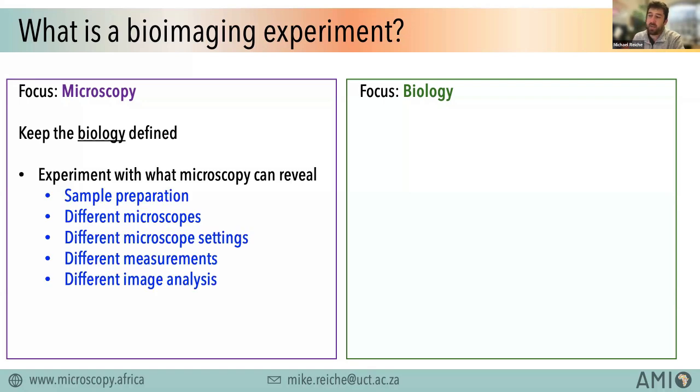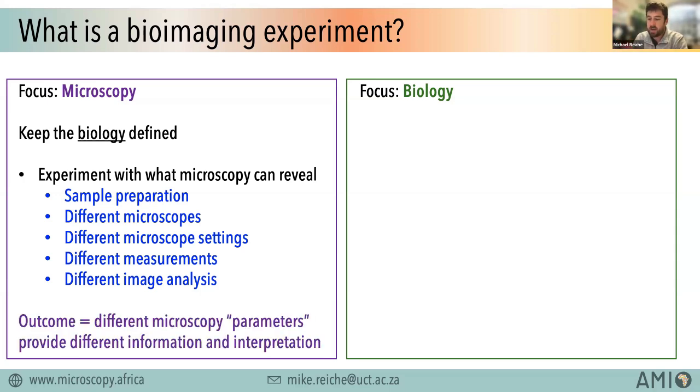And by saying that, that means that you get to play around with the sample preparation, you get to try different microscope settings, you get to try different analysis approaches and things like that. All of this focuses on the microscopy or the technical aspects of the microscopy. And your ultimate outcome is that you can understand how different microscopy parameters can provide different information and how you are able to interpret that information.